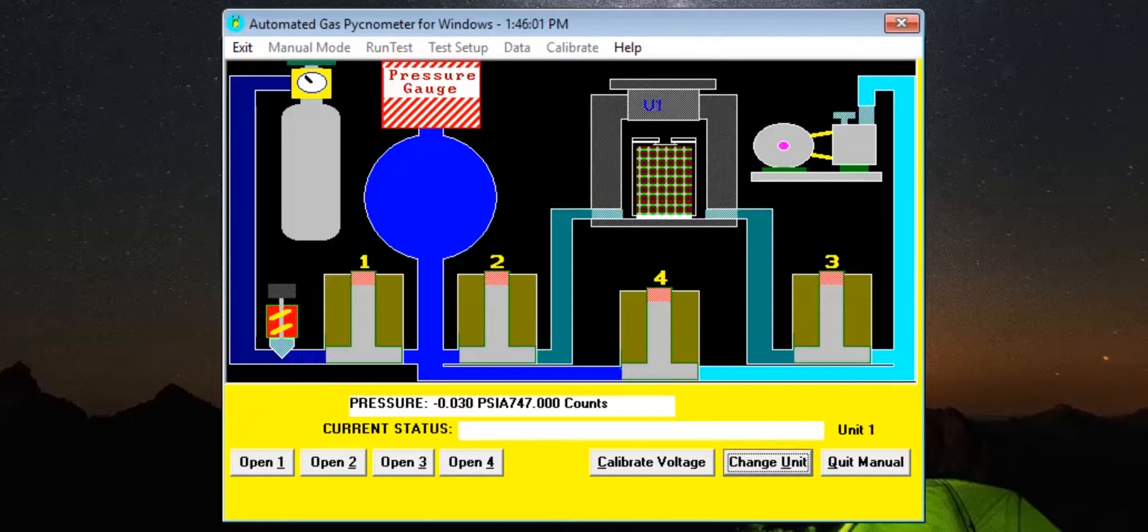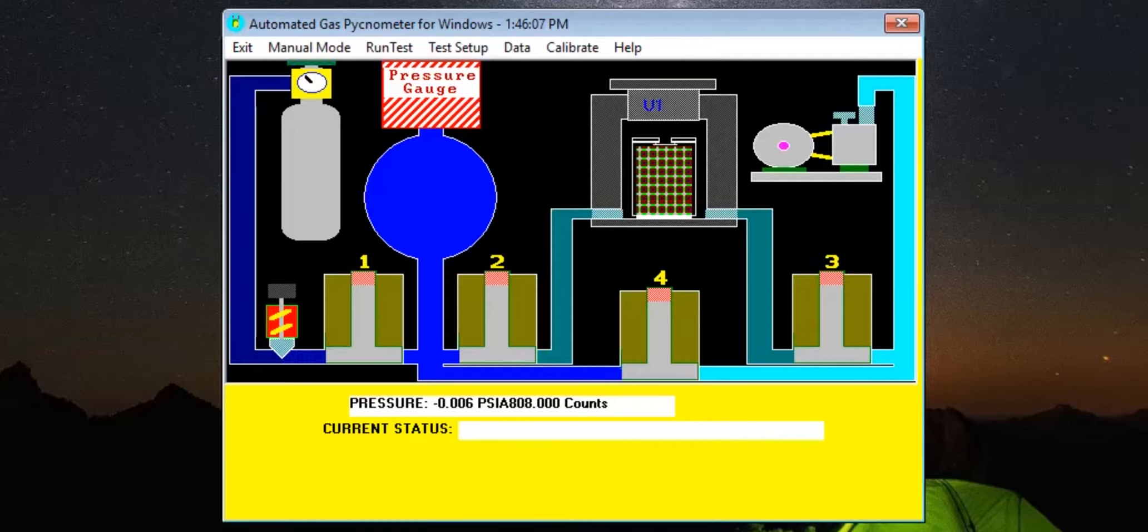When it is clear that all components are responding properly, the next step will be to calibrate the PYCG100A. This will ensure the accuracy of measurements taken from samples under test, and will only need to be performed upon first use of the machine or if it is suspected that measurements are inaccurate.